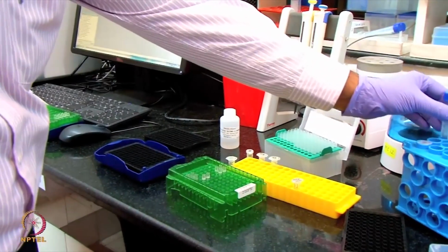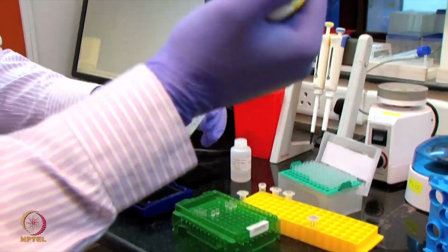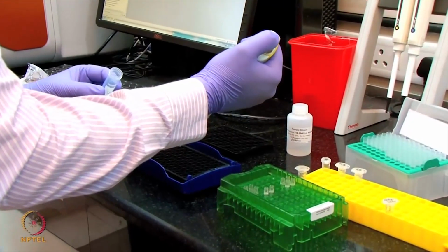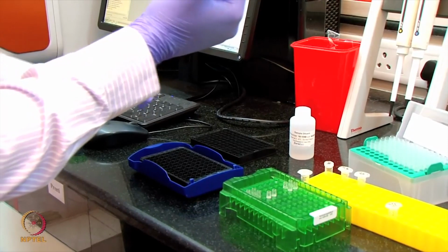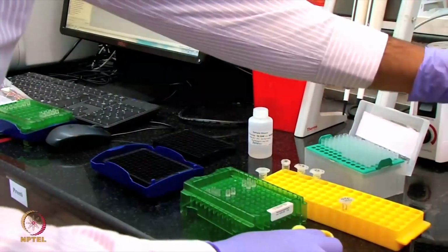Now I am going to do this hydration of the streptavidin sensors. What I am doing is adding 200 microliter of the 1x PBS into the 96 well plate.